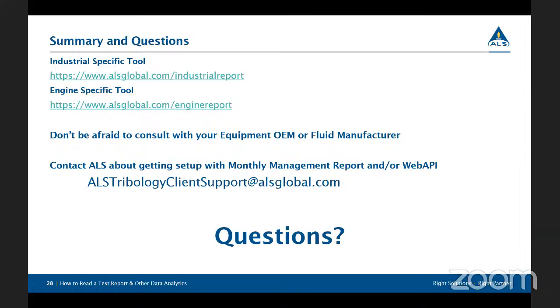So sometimes it feels standard, but most of the time there is somebody reviewing, and the reason that there are standard phrases is just due to time. It really speeds it up for us because we see a lot of the same things over and over, and you can imagine typing the same thing over and over would become quite tiresome. So it's purely out of efficiency, but I can assure you that, especially when the report isn't normal, if it's abnormal or severe or caution, those diagnosticians are reviewing it and tailoring exactly what it says based on what's going on. Ryan asked if base number is the be all end all.